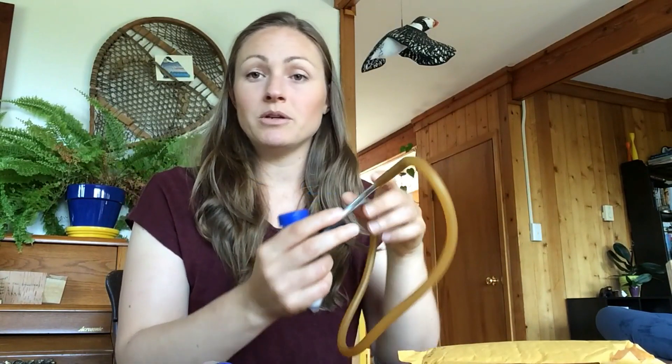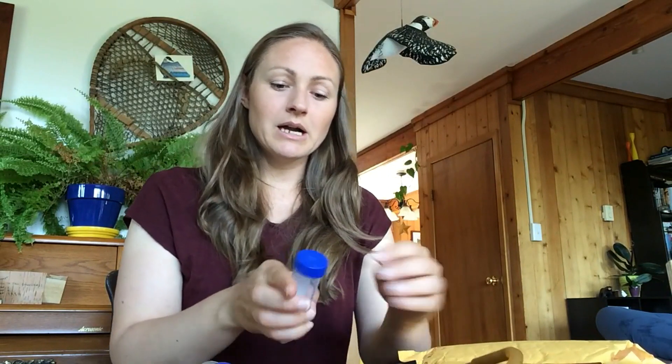At this point, the pooter is ready to be put on another collection tube and you can go to a different habitat. When you're done collecting, you want to really make sure that you write the appropriate information on the collection tube, and then you also want to make sure that you write the information from the tube on the data sheet. Record all the information that we need there.